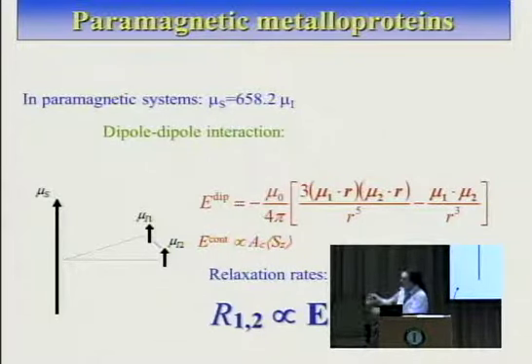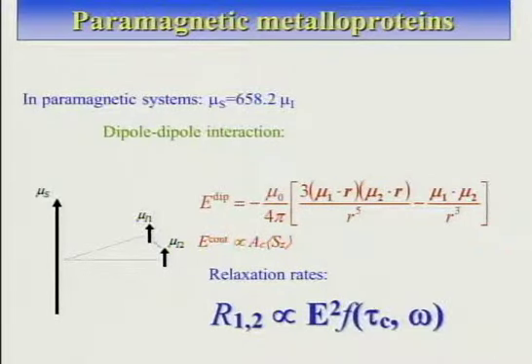So it's the MAXOCC lecture. This protocol that we set up, which we call maximum occurrence, MAXOCC in short, is based on using paramagnetic NMR data together with SAXS data, as I mentioned already. So we first have to spend some time defining what paramagnetic NMR data means.